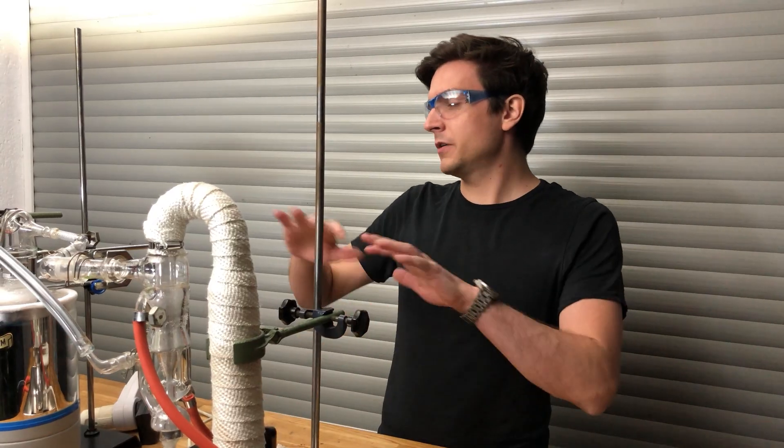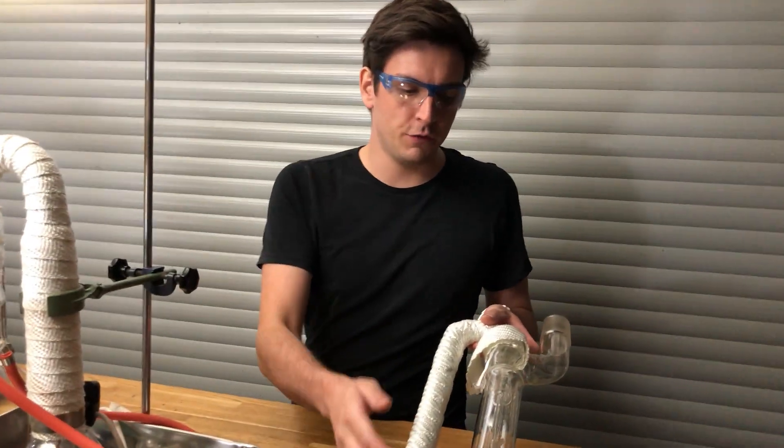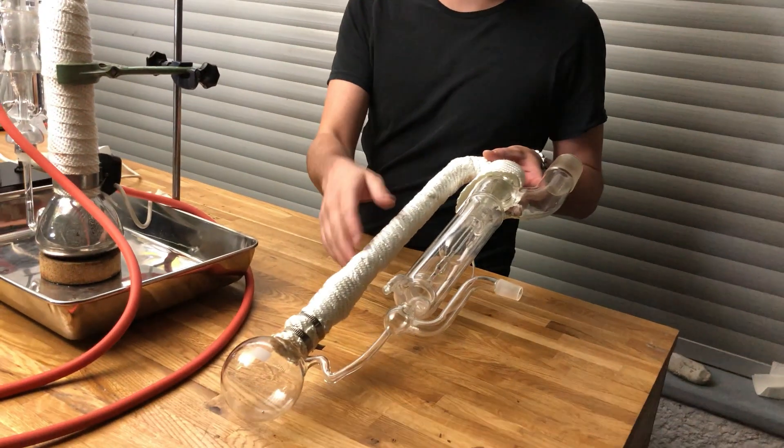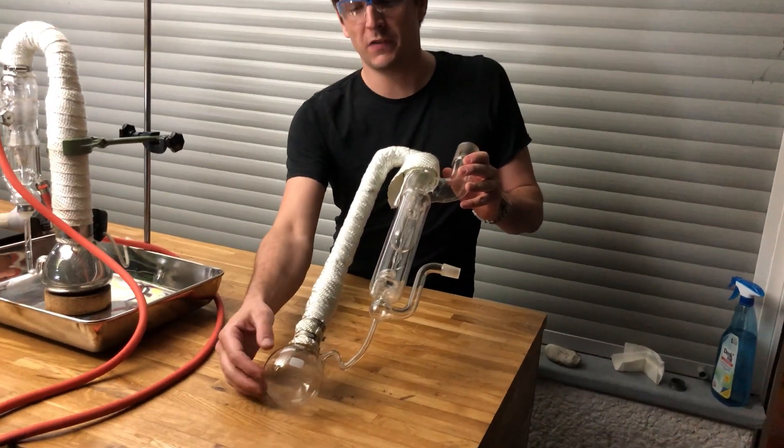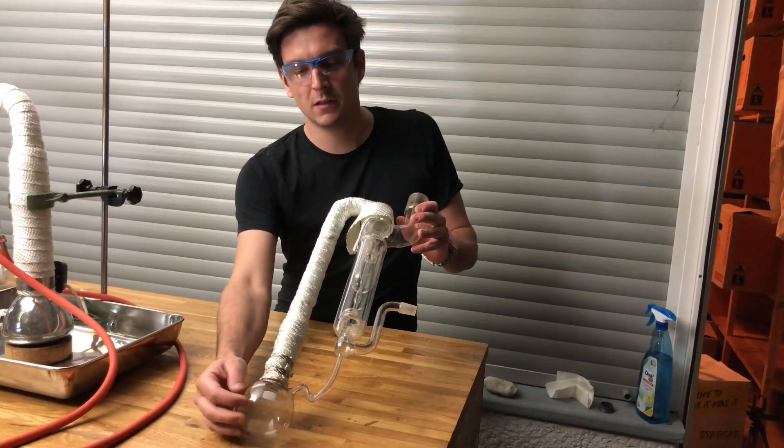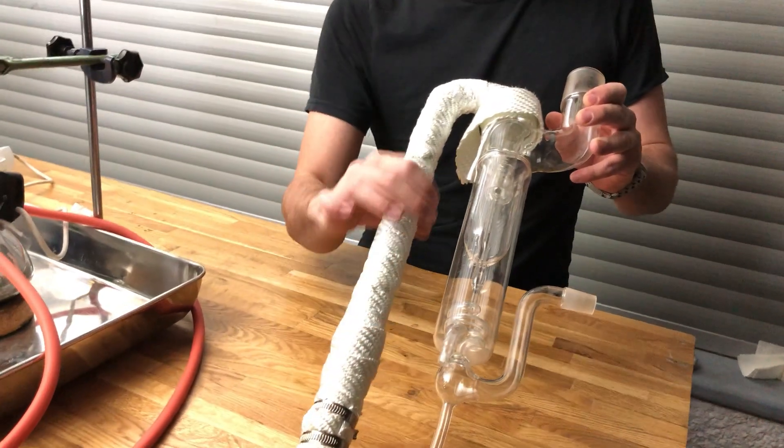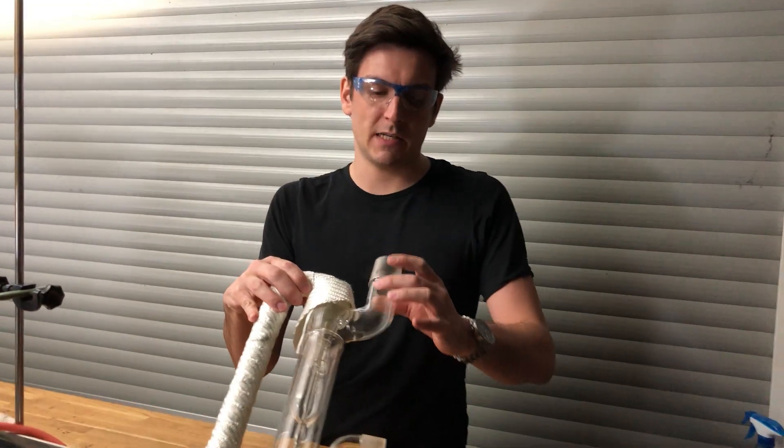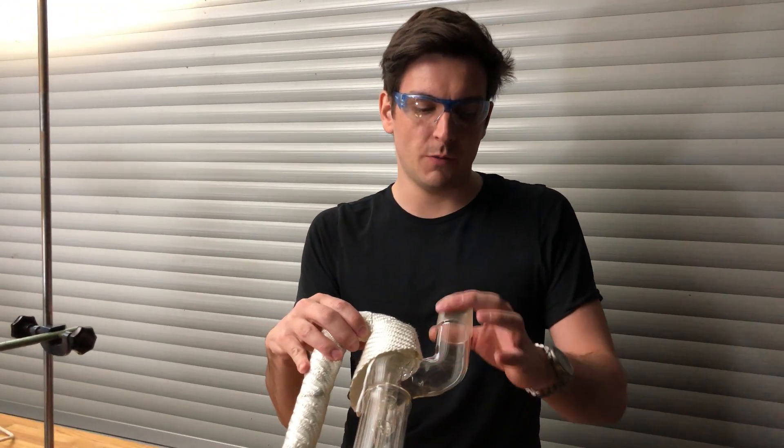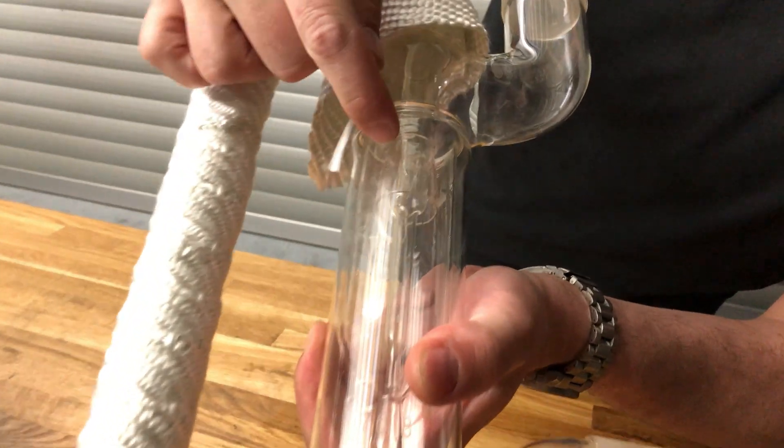And I thought before we disassembled everything here I would like to explain to you on this example here. This is a mercury diffusion pump without any mercury in it, how this type of pump works. We basically have mercury at the bottom in this flask here and we are heating the mercury. It boils, travels up this long tube on the side which is insulated and travels down here. As you can see the high vacuum site is connected at this large flange on the top here.